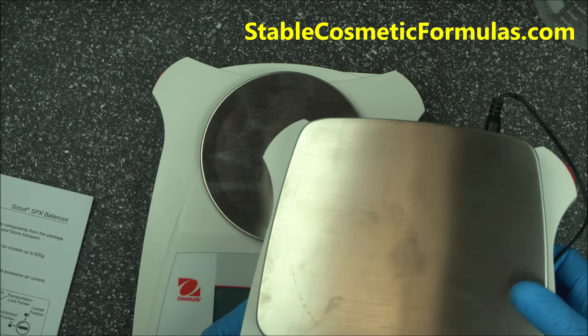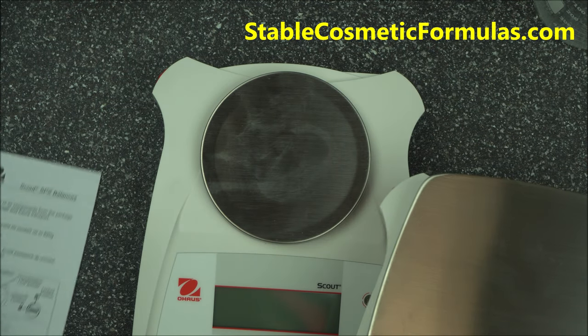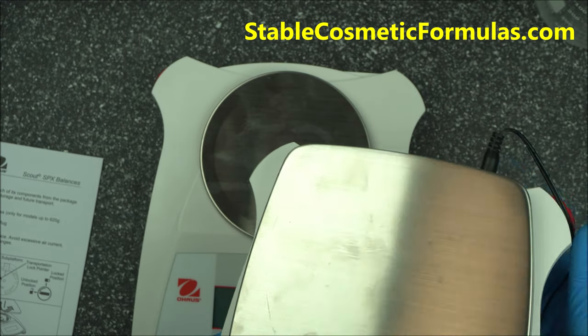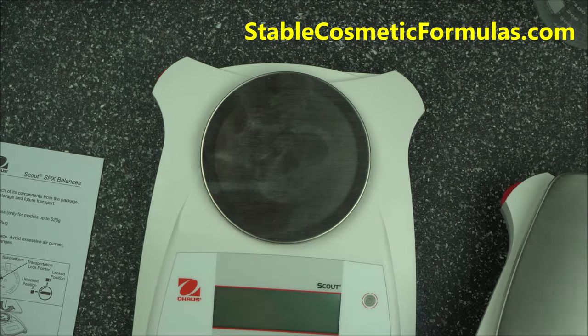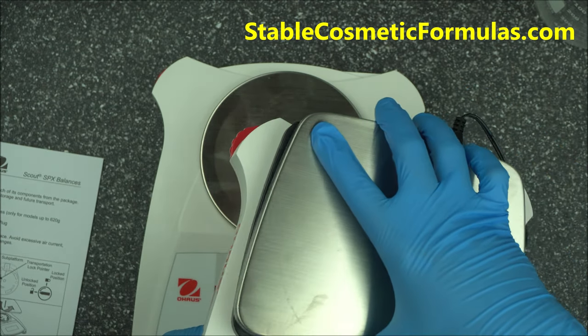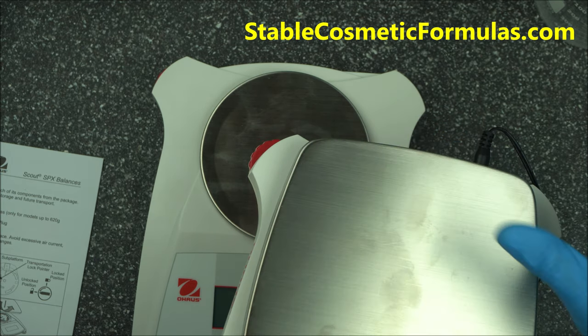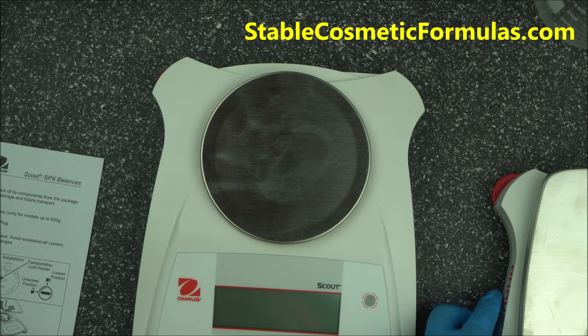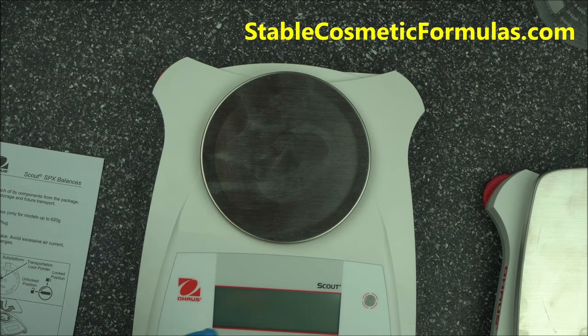The bigger version is the one that will click — if you have that version, just plug it in and turn it until it clicks. But for the SPX Scout 421, just put the pan in and leave it. You don't need to remove it after.